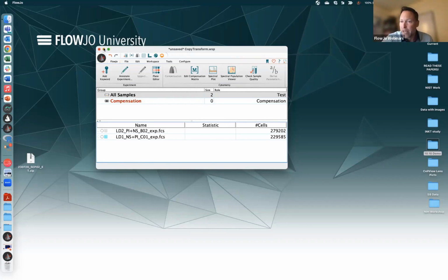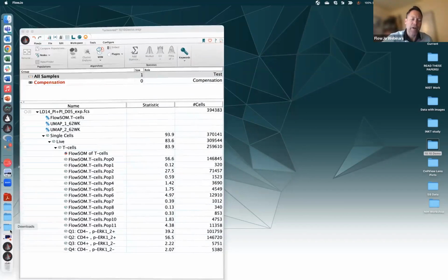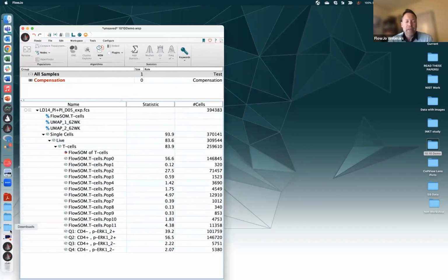All right, there's that. How are we doing? We're doing okay time-wise, I think. Let's go here. So here, oh, sorry, UMAP person. I already ran the UMAP, but easy enough to fake the demo.